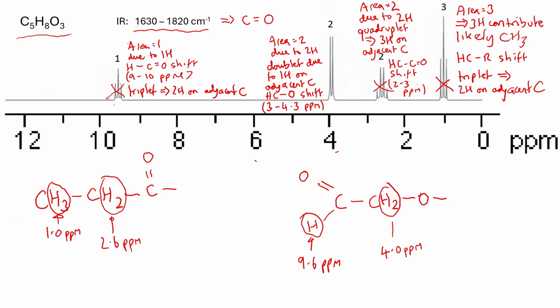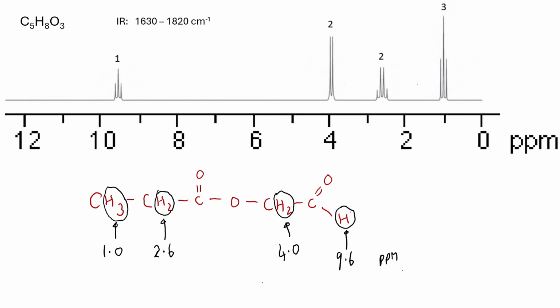So we now have 2 fragments. When you add up all of the atoms, they account for the whole of your molecular formula. We've got a bond with something on the end of it here. We've got a bond with something at the end of it here. So all we have to do now to get the final structure is join them together. There it is, your final answer.